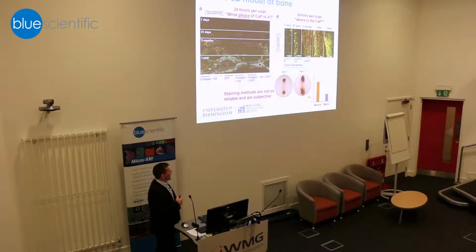So I think in summary there, XRF gives us a really quick, early window into quite subtle chemical changes in tissues as they mature over time, and it's quite part of our workflow.